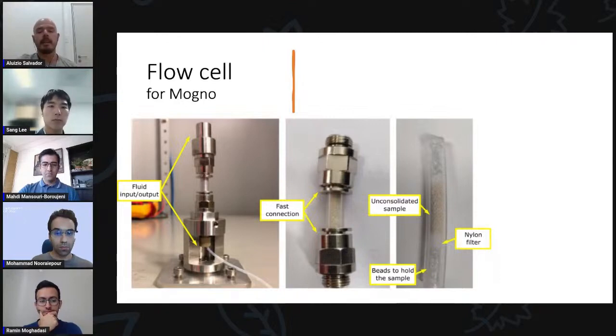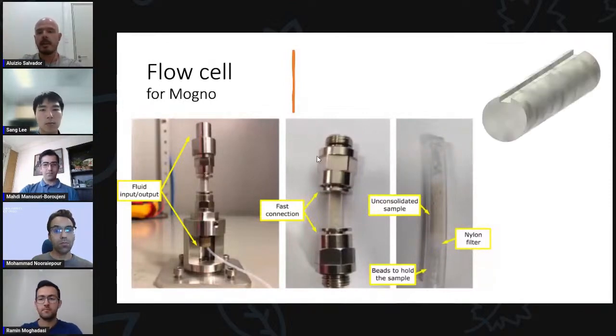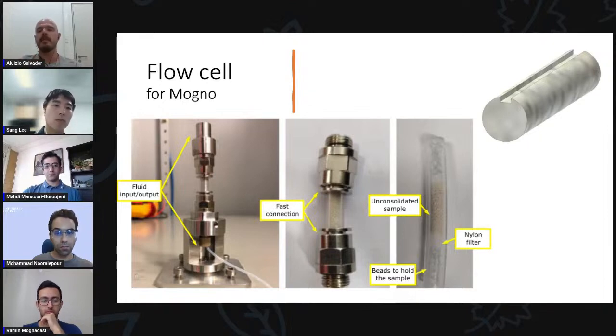And what we are planning here is to make an experiment as close as possible to the one that we are performing at the Carnaúba beamline. We will substitute these unconsolidated samples for a cylinder. The cylinder will be inside this tube, and we'll draw a channel along this cylinder. So when we inject the fluid, it will preferentially pass through the channel instead of the pores. Again, we are going to have a controlled environment, which for us, that are at the beginning of the project, is very important just for understanding how the surface reactions happen here.